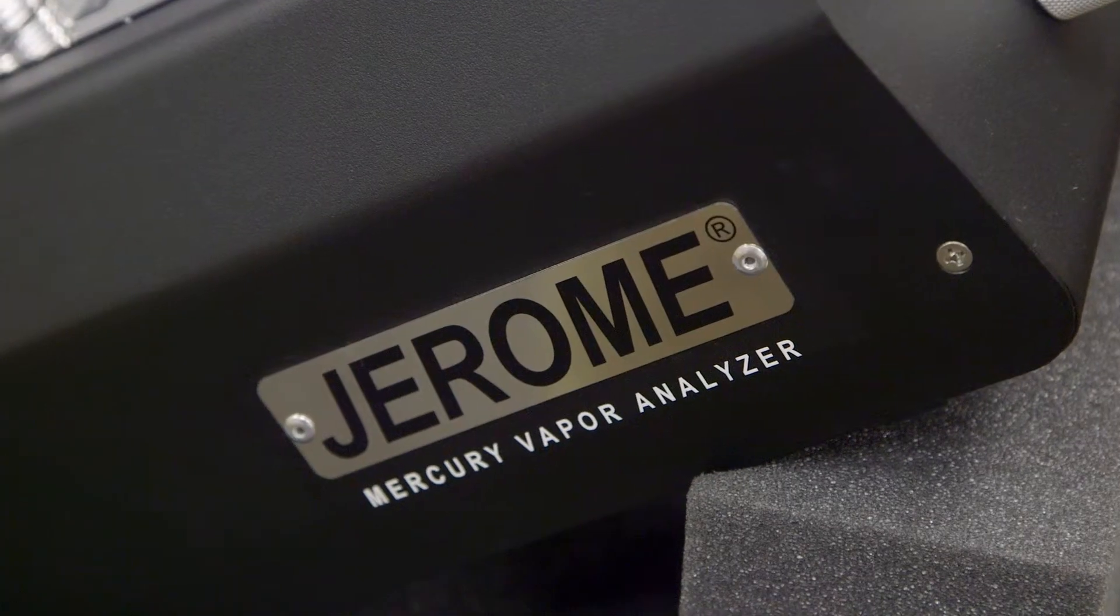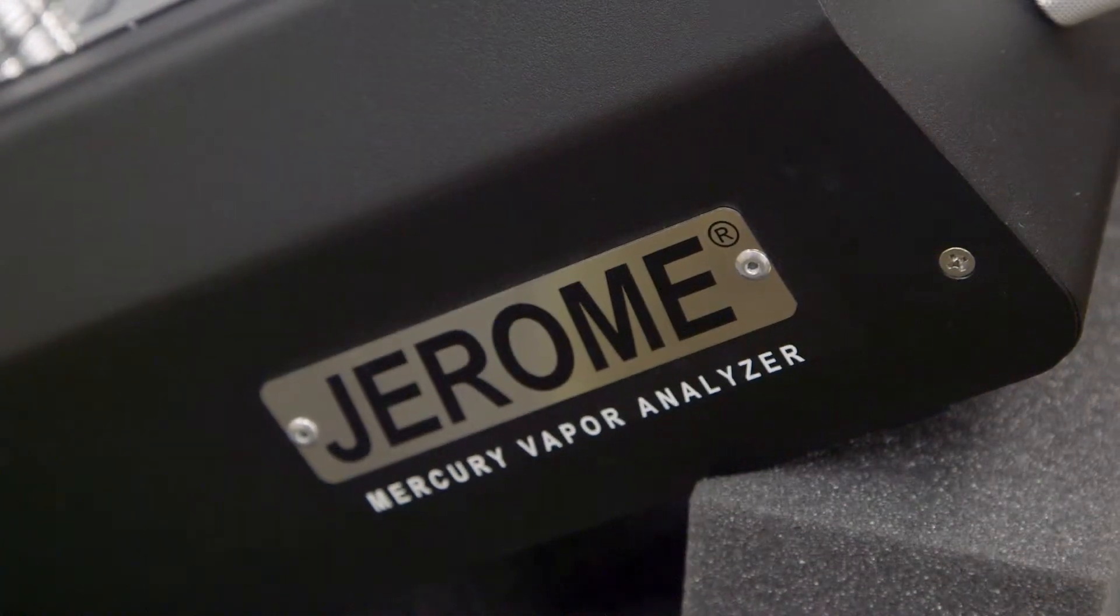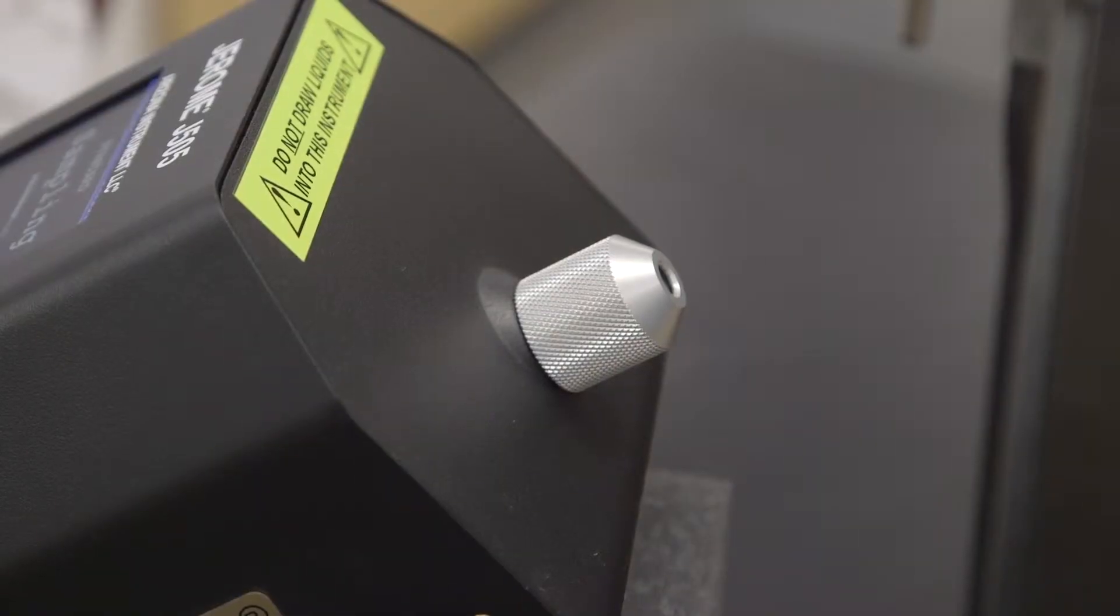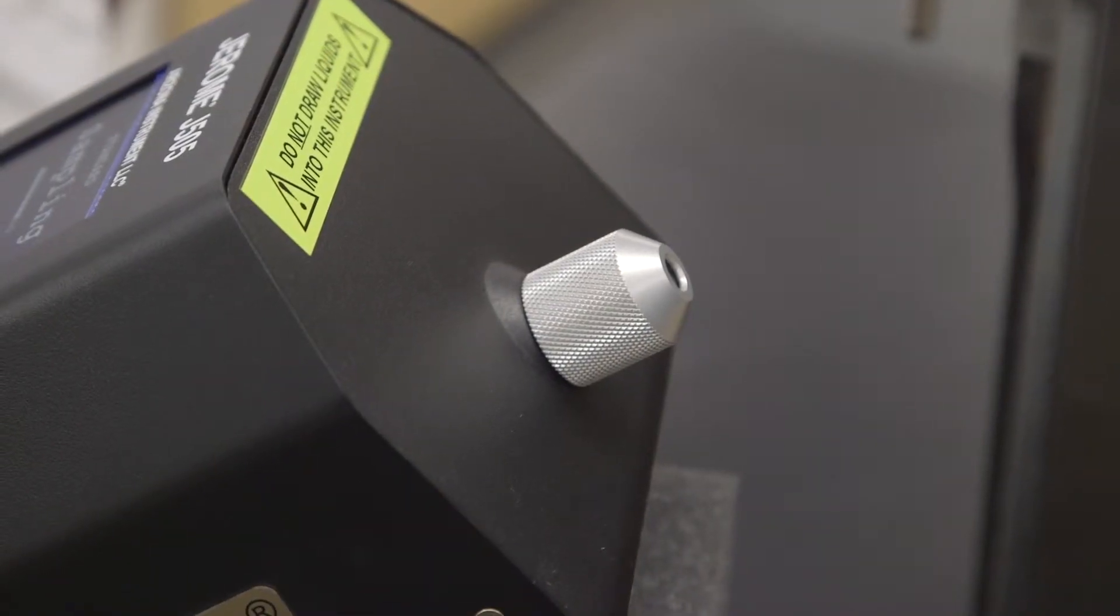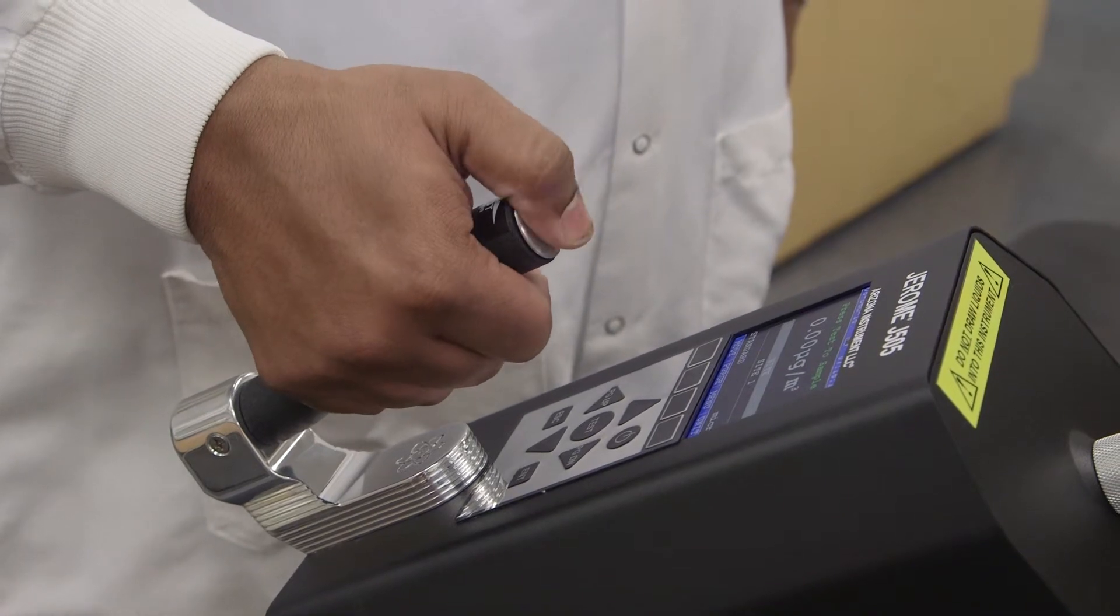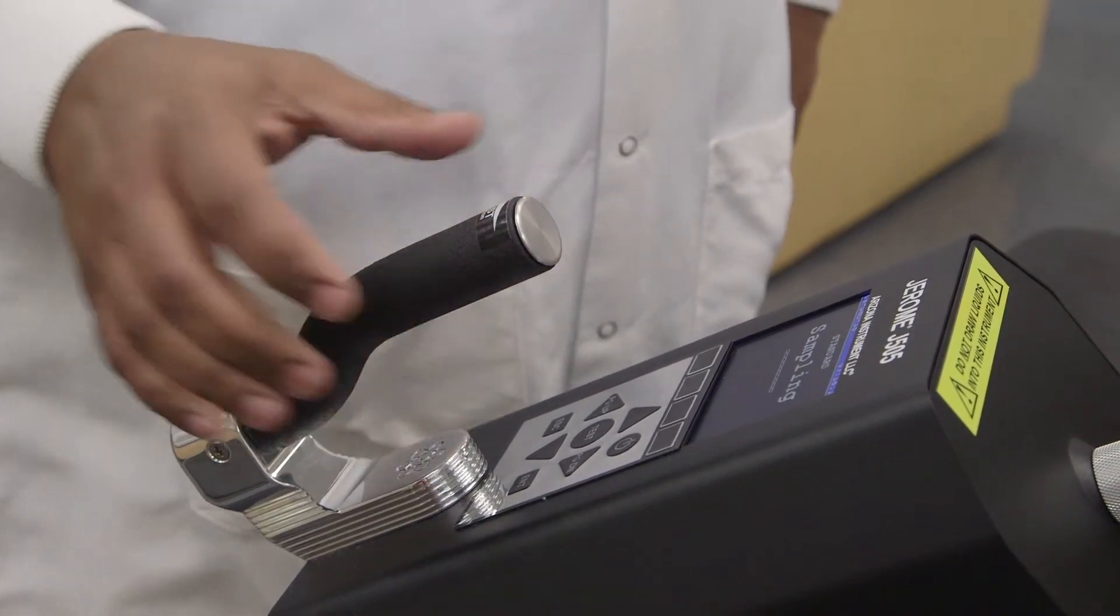The same technology is used in more expensive benchtop analyzers. This allows the detection cell to be simpler, smaller, lighter weight, and more durable than atomic absorption spectroscopy instruments.